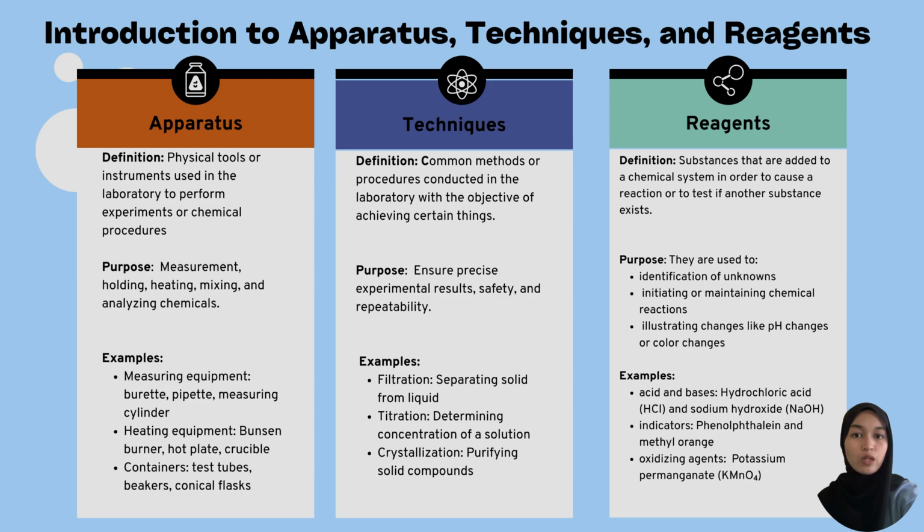First, let me explain what apparatus, technique, and reagent are. Laboratory apparatus are the physical tools or instruments used in the laboratory to perform experiments and chemical procedures. The purpose is to facilitate multiple operations such as measurement, holding, heating, mixing, and analyzing chemicals.